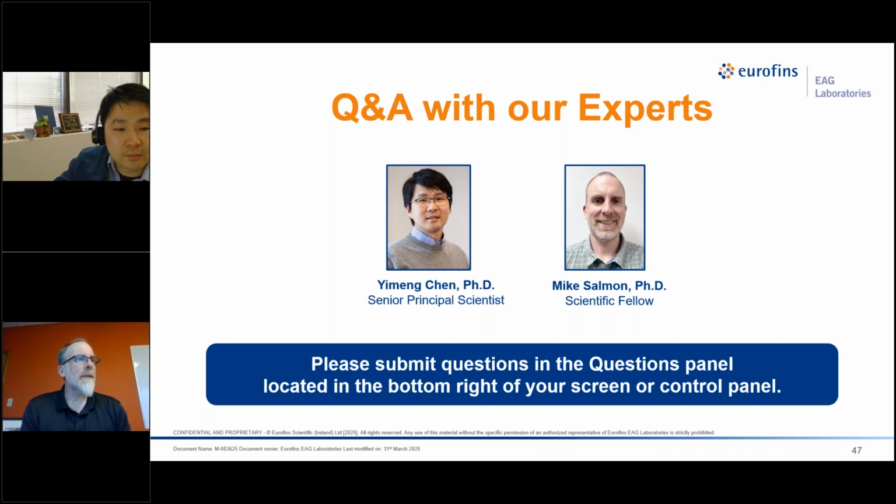Let's see, the first one is, how do you avoid or minimize gallium FIB damage for APT sample prep? Oh, yes. FIB damage is very common for samples prepared by gallium FIB, and it's very similar to what you have with the TEM sample preparation. As I mentioned before, we first put a protective layer that has a good gallium stopping power.